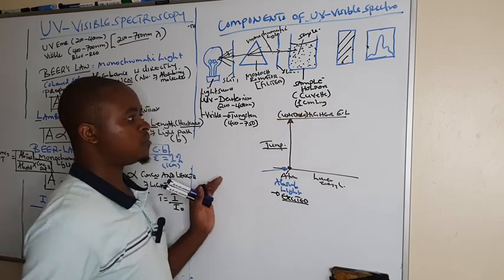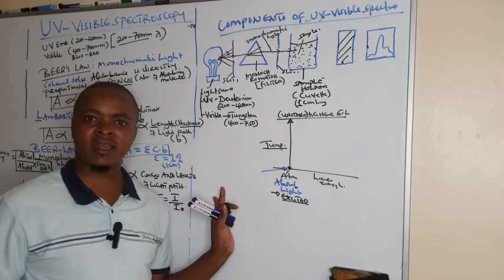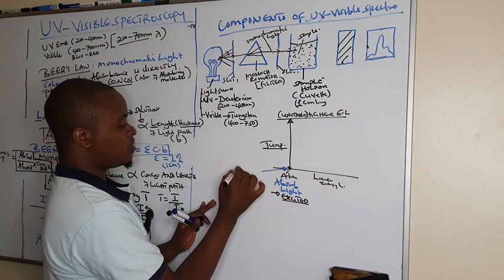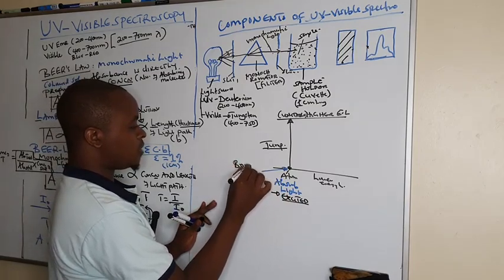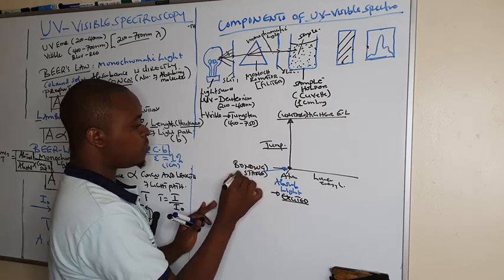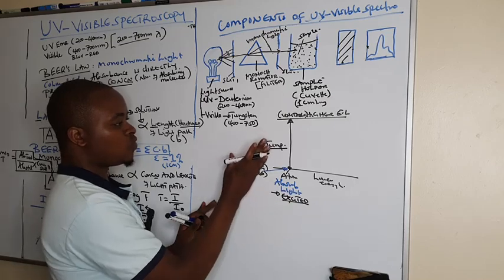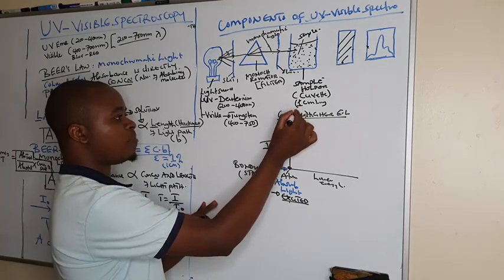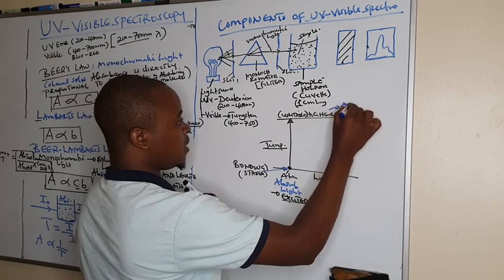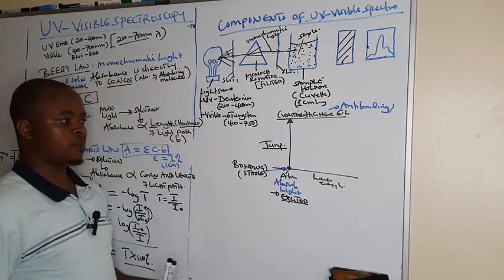They are unstable, and because they are unstable, they have to come back to the lower energy level to gain stability. Because at the lower energy level, they are bonding, that's why they are stable. But when they absorb light, they become excited and lose the bonding and jump to the higher energy level, whereby at the higher energy level they are anti-bonding. So that's why they are unstable.